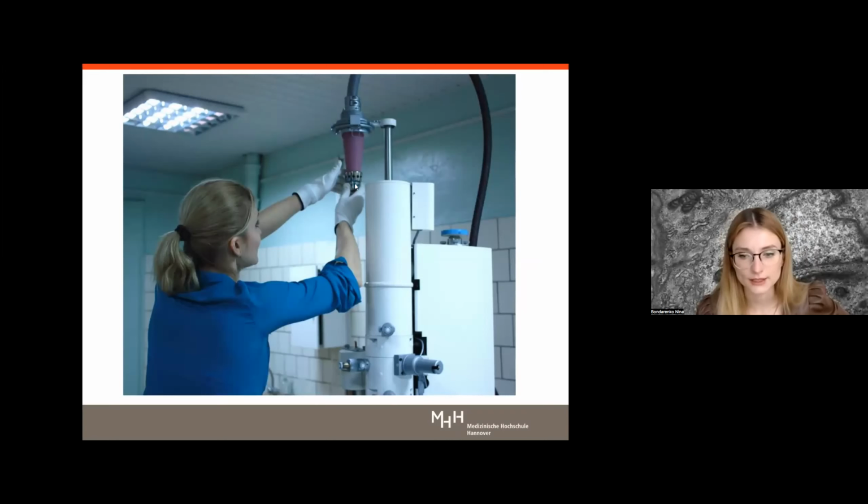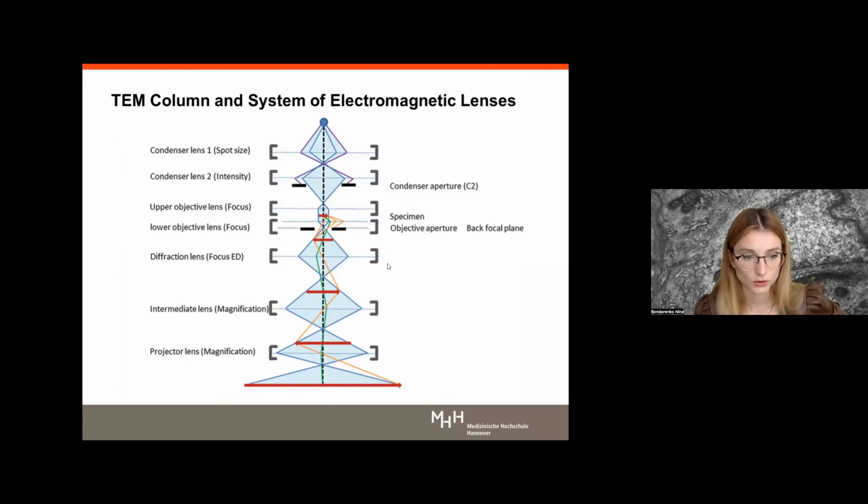And after that, an obligatory adjustment, because the top of the needle of the cathode must be ideally in the center of the cathode gun, and for this reason we use different tools. And after that we again put this electron gun in the column, pump the vacuum, and adjust our beam to the working mode.